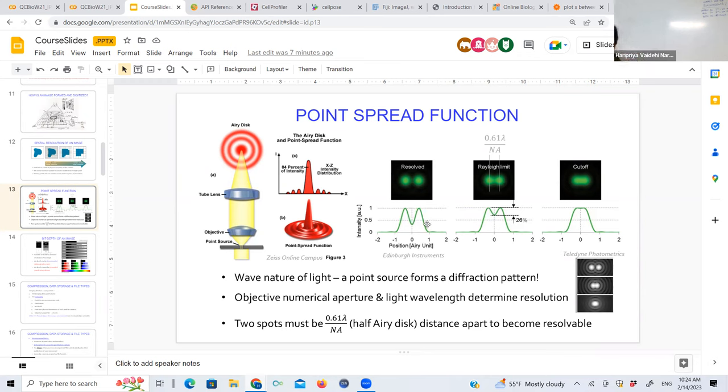And this is true for all optical instruments, telescopes, microscopes, everything's diffraction limited. What this also means is that everything is proportional to the wavelength. So if I'm imaging something in really blue light, say Hoechst, which is a very blue dye, I illuminate in UV and it emits in blue. It's going to be totally different from a dye which also stains the same nucleus, but I excite it in far red and it emits in near infrared. Totally different because the wavelengths are different.